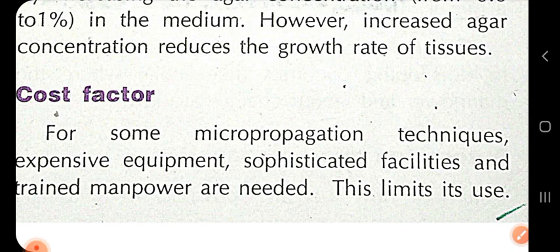The culture room should obviously be enclosed and should not have any ventilation system. An automated sensor system should be present so that it can regulate the temperature as well as the humidity, and at the same time maintain the light phase and dark phase, just like day and night. So many things.